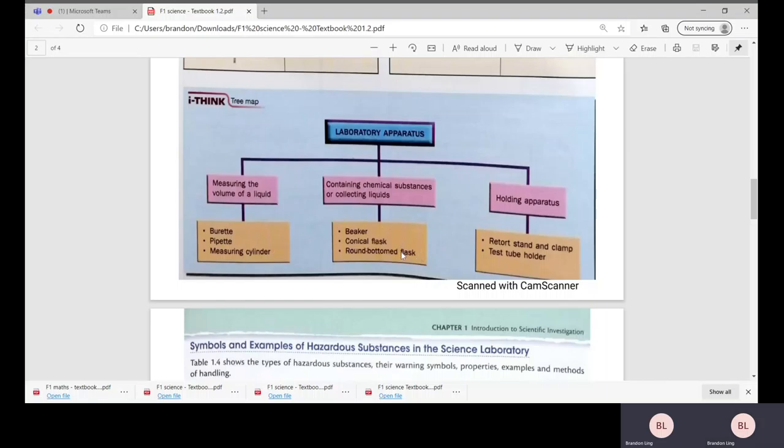Beaker, conical flask, round bottom flask, and lastly we have the retort stand and clamp, and also the test tube holder.